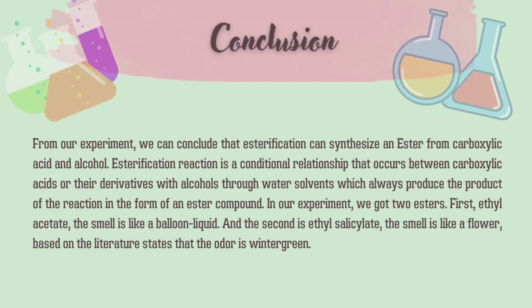From our experiment, we can conclude that esterification can synthesize an ester from carboxylic acid and alcohol. Esterification reaction is a conditional relationship that occurs between carboxylic acid or their derivative with alcohol through water solvent, which always produces the product of the reaction in the form of an ester compound.